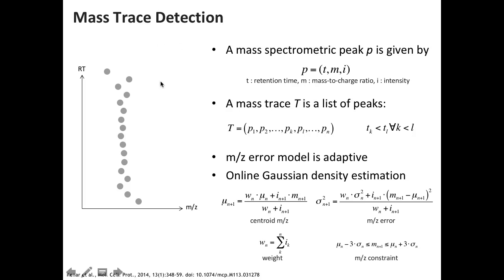So what we actually do is we start with an estimate of the error that can just come from the instrument. You ask your experimental guy who runs the mass spec, what's your mass error on that instrument? He'll tell you, don't know, 1 ppm. And that's a good enough estimate to get started with. But actually, in this local region where we're looking, this mass error is much, much lower than that. And we will make use of that to assemble these mass traces.